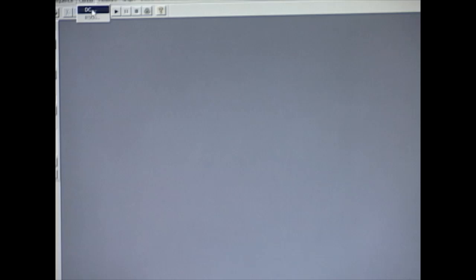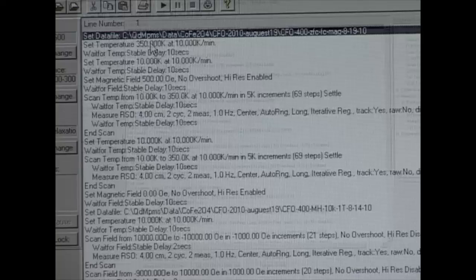Click full DC scan. The curve is centered at 2 centimeters. Different program sequences establish the conditions for the measurement.